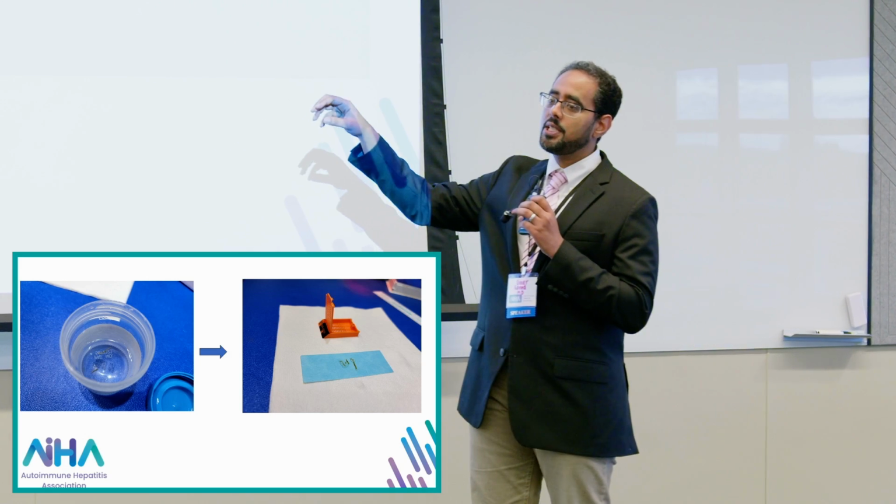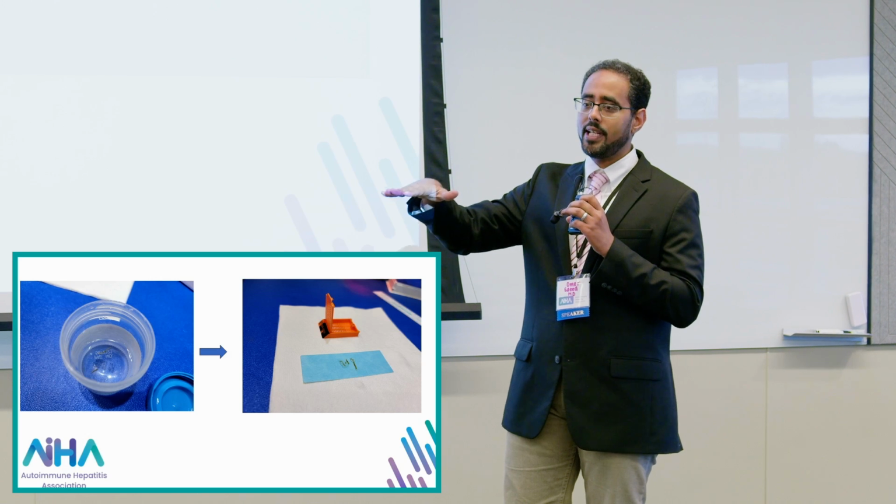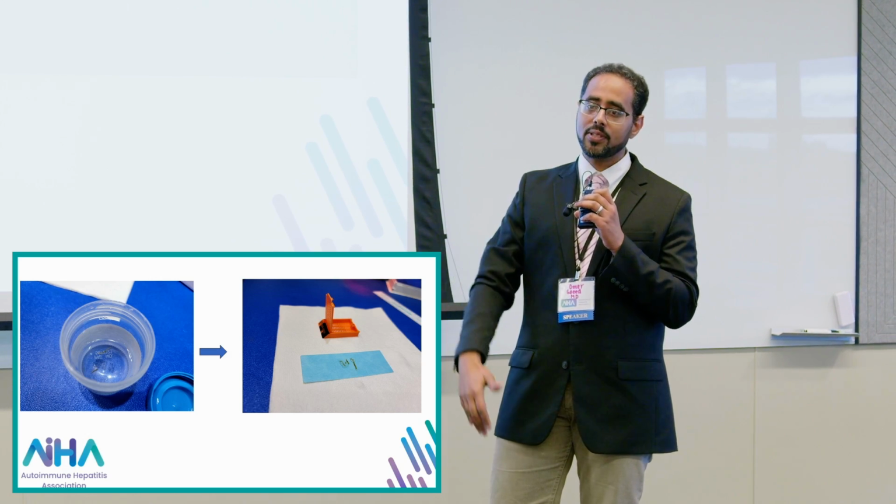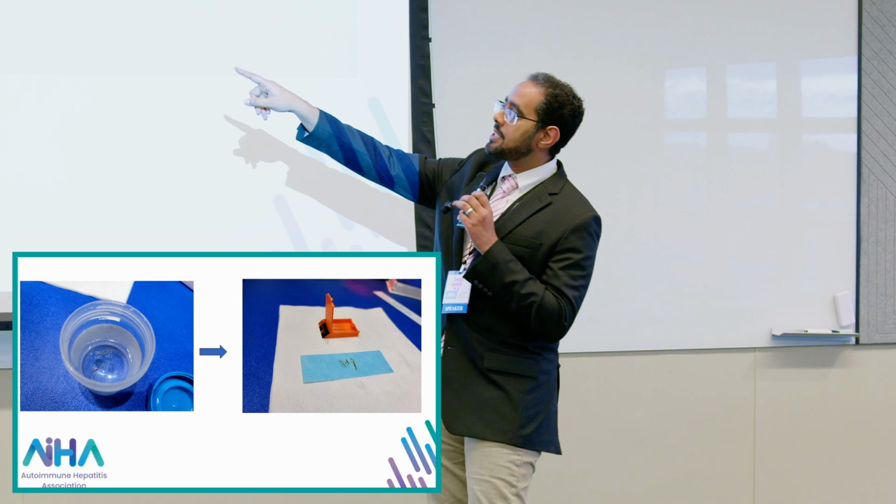That's what we call fixation of the tissues. It kind of suspends the process. Everything stops at the moment they took the tissue out, so we can see what happens under the microscope. So that's the formalin. Let's get to our lab.